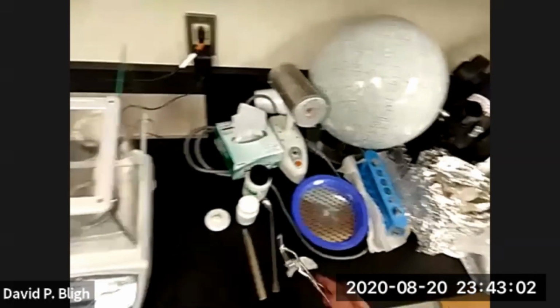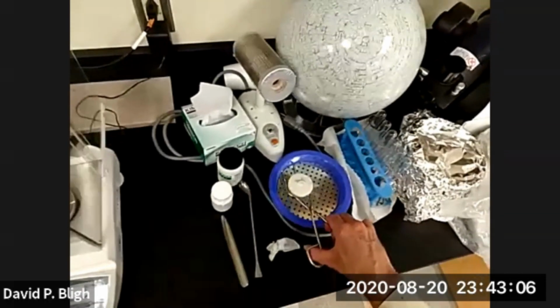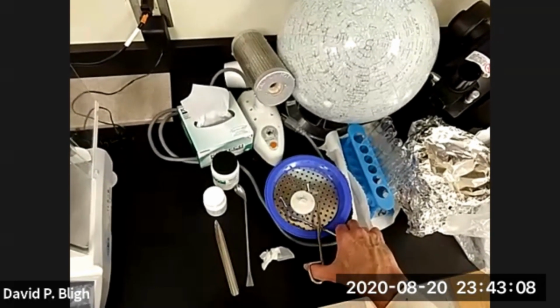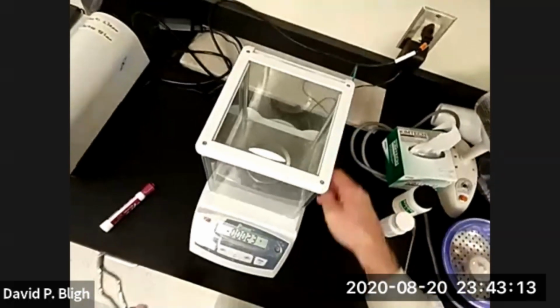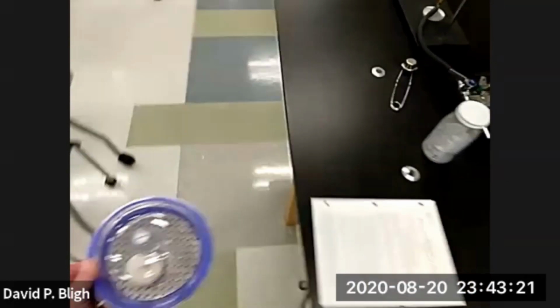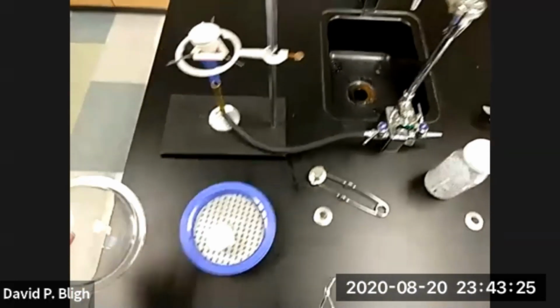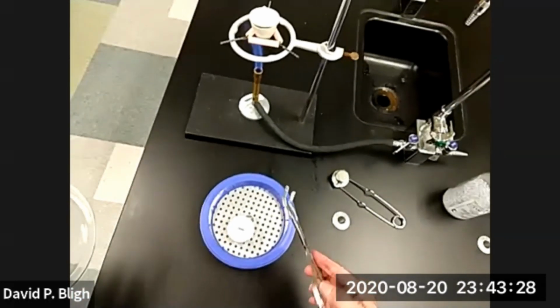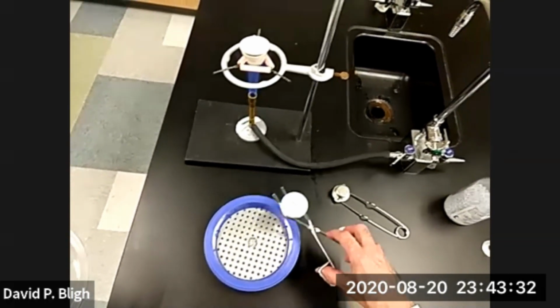Let's move it to the desiccator just so it's easier to carry. Here we go. Now, we'll let that settle down before we bother zeroing it. Okay. Now we can remove our copper sulfate and crucible. Set it aside.